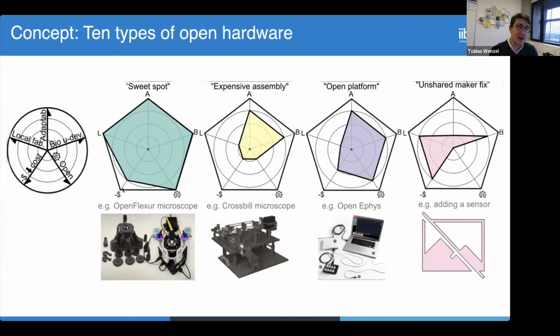I should say proprietary equipment, because these can also be commercially acquired as kits sometimes. So then they're also commercial, but they're not patent protected, so they're not proprietary. And in contrast to this, there is an open hardware approach that's the most popular. That's the most popular one here.